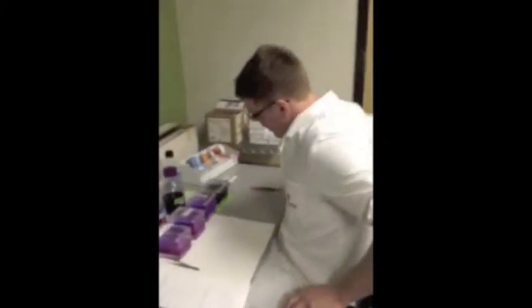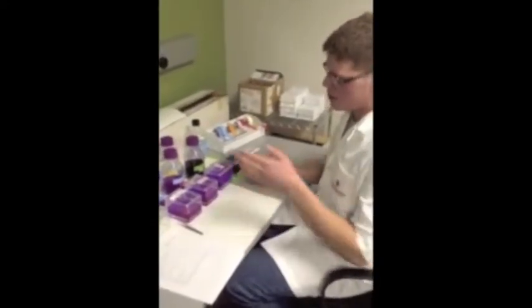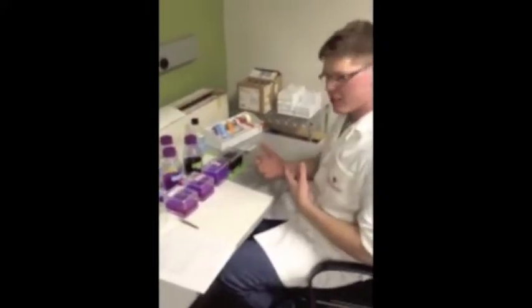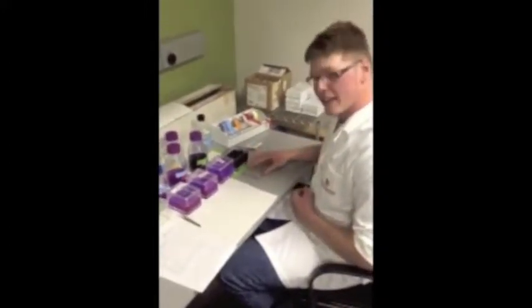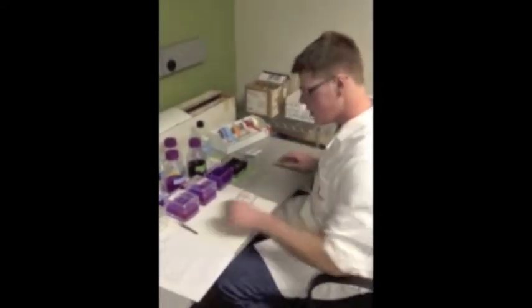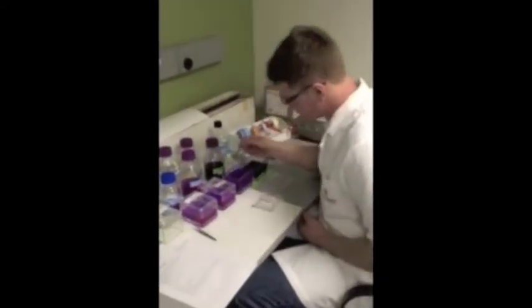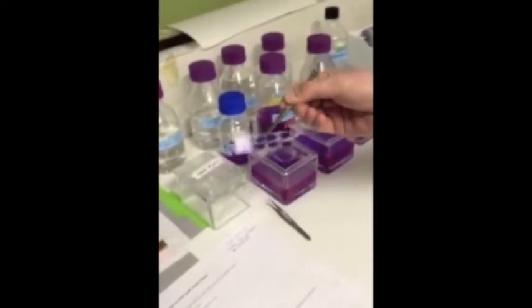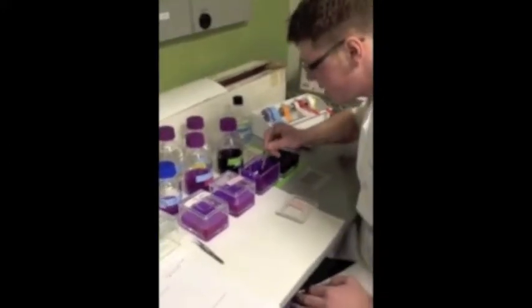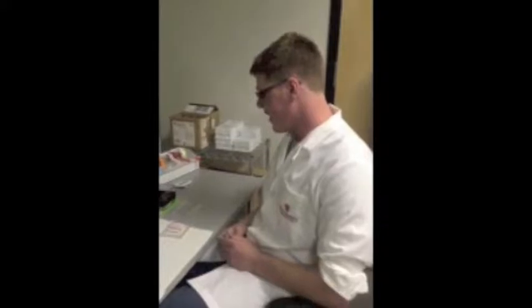When we're looking at cresyl violet staining, we use a series of ethanol baths. So we prepare the sample, put it in an ethanol bath, which clears it out, and then we'll stain it in a cresyl violet solution. And then we'll wash it multiple times to make sure all the dye is out. And it'll result in a slide with very well stained rat brain specimens. And then we can look at the slide under light microscopy and better visualize the difference versus an unstained sample. So that was just a quick once-over on cresyl violet.